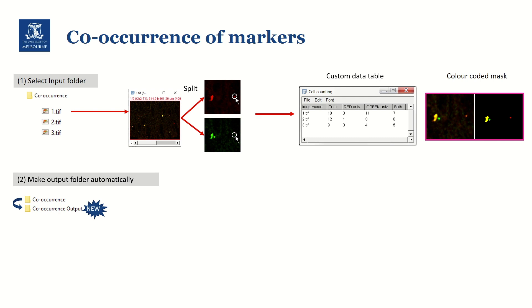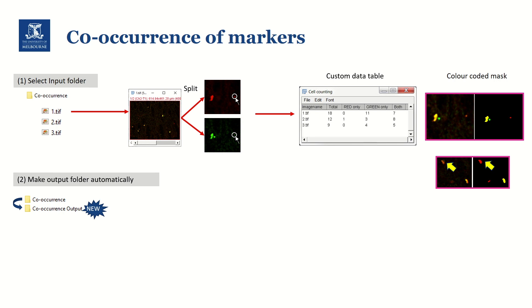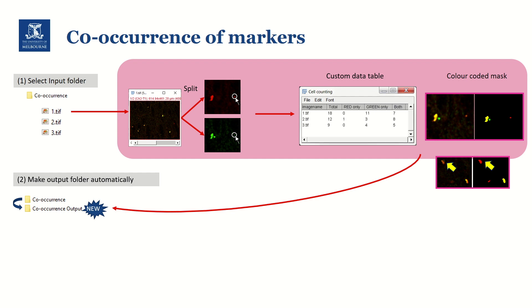This will be a handy visual tool for us to quickly identify if our result is reliable or not. For example, in this proof image, based on our threshold setting, this cell was detected as positive to red only, but also could be detected as positive to both markers. So we can pick up wrong results quickly and modify our analysis settings using this proof image. Once we have the complete table and the proof image, we will save them to the output folder. So this is the general scheme — let's plan out the details of this processing step.